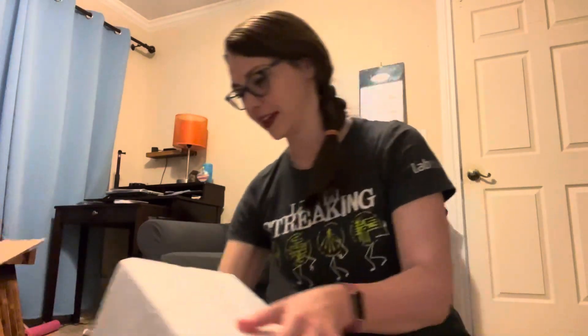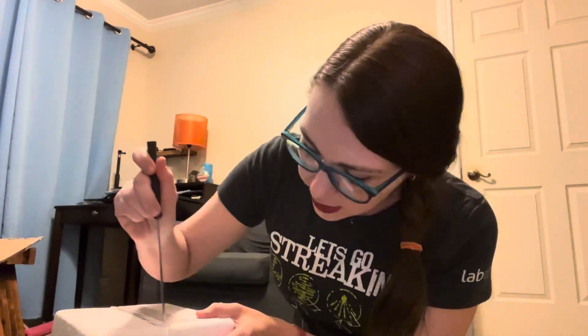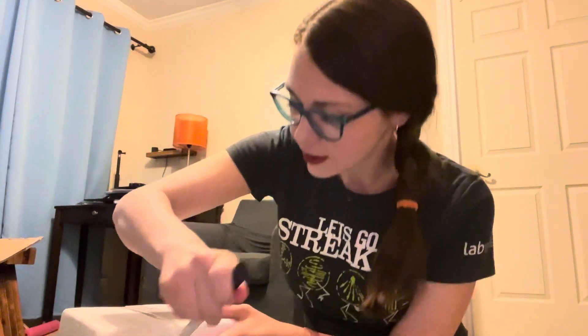My dog is in here — he thinks I'm being attacked or something. All right, this is interesting. Interesting way to wrap it.